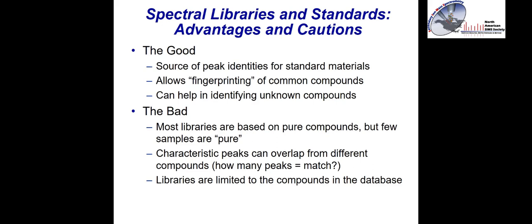For example, I did a study once looking at a mixture of lipids with protein, trying to determine if we could detect the protein within the lipids. But it turned out that since we were using a lipid that had a nitrogen in its head group, it could form fragments that were identical to most of the protein peaks that we would look for. And so that limited the ability to separate out those two materials.